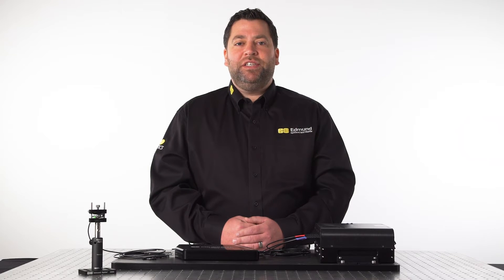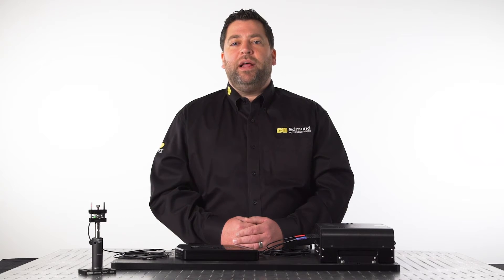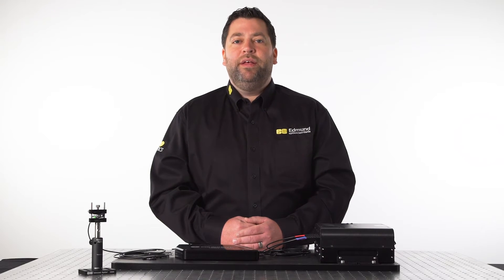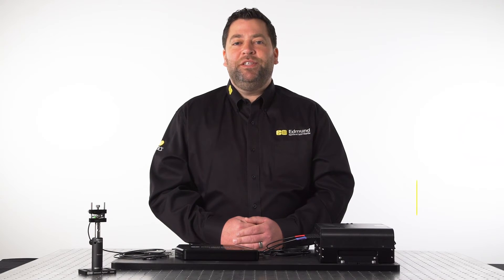Many advanced microscopy applications often require multiple lasers illuminating a sample at the same time. One way to achieve this is by coupling the lasers into a single fiber to utilize a microscope's fiber input. The Coherent Galaxy laser system makes that process easy. Hi, I'm Aaron O'Donnell, product line engineer at Edmund Optics, here to go over what's included with the system and how it operates.